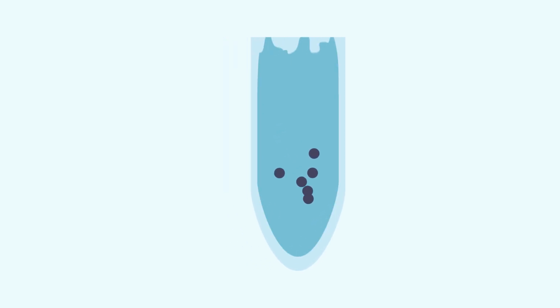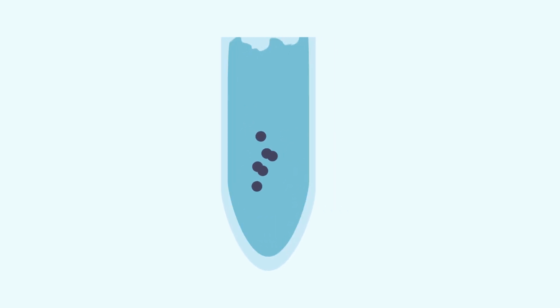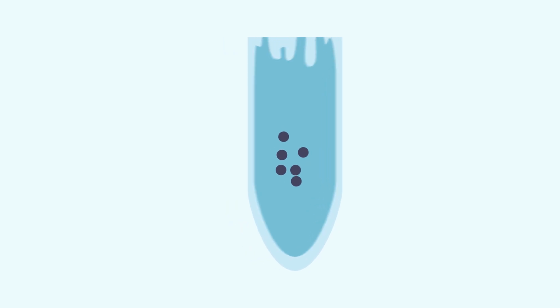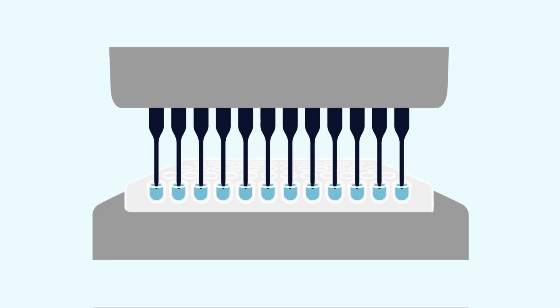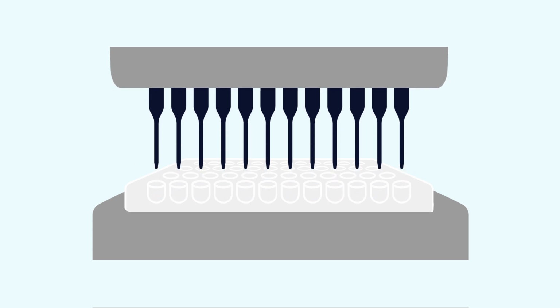During the binding step, volumes are often large, and max RPMs for vortex mixing cannot be used. If pipettes do not drip during transfers, splashing during the binding step is the most common cause of well-to-well cross-contamination. A standard 2 milliliter well plate can typically handle 1 to 1.2 milliliters of liquid before cross-contamination during mixing becomes a problem. If throughput and your robotics setup allow, you can also mix by pipetting.